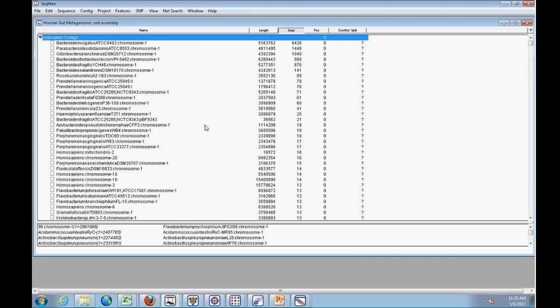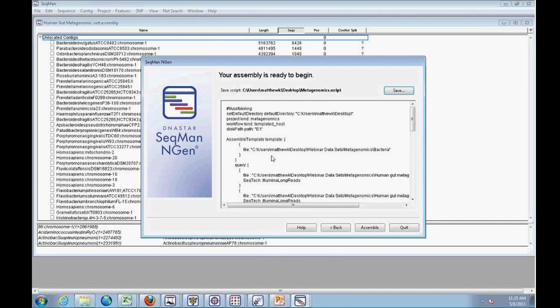So moving on from that, I want to briefly discuss the 16S workflow, which is very, very similar to the metagenomic analysis that I showed, but instead you're just using 16S data instead of our different metagenomic reads that we've done.